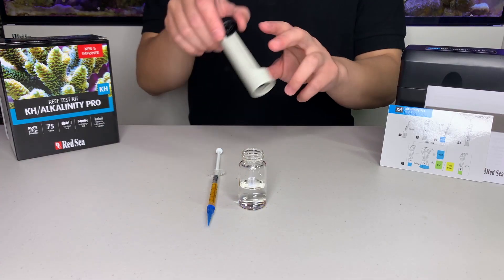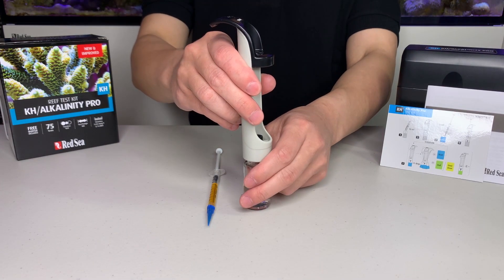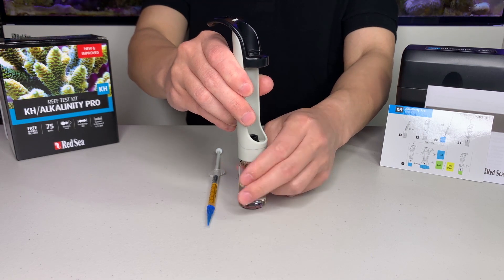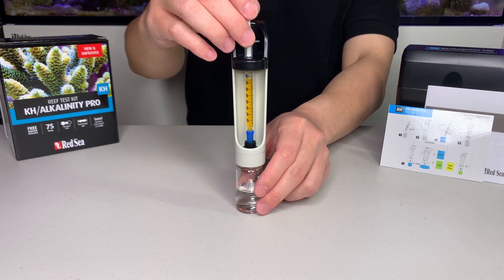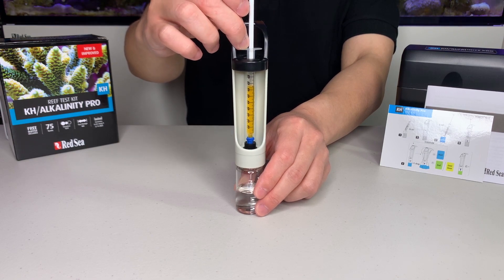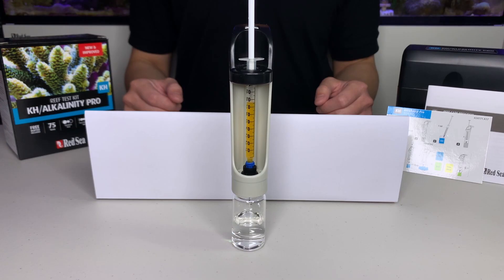Now we are going to assemble the titrator. Screw in the vial onto the bottom, and insert the syringe into the titrator. Make sure the scale is clearly visible. For best results, it is recommended to perform the test in light that is as close to daylight as possible. Yellowish or bluish light may affect your perspective on the endpoint color.